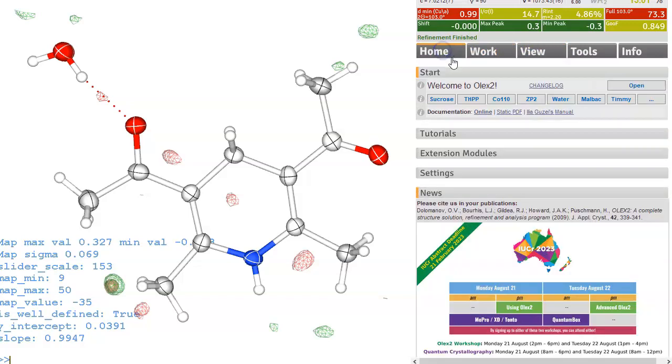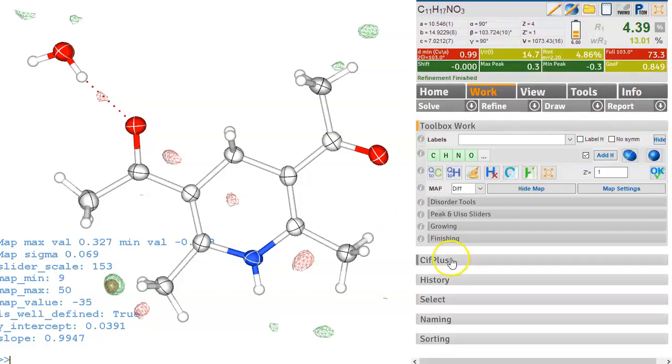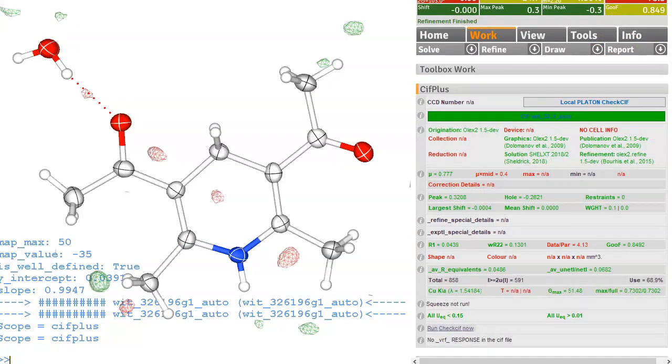We do have this little plug-in here the CIF plus so CIF plus gives you a view into the CIF file. If there's any red lines then this is going to cause trouble with the referee at some point so these bits of information here they really need to be found and filled in.